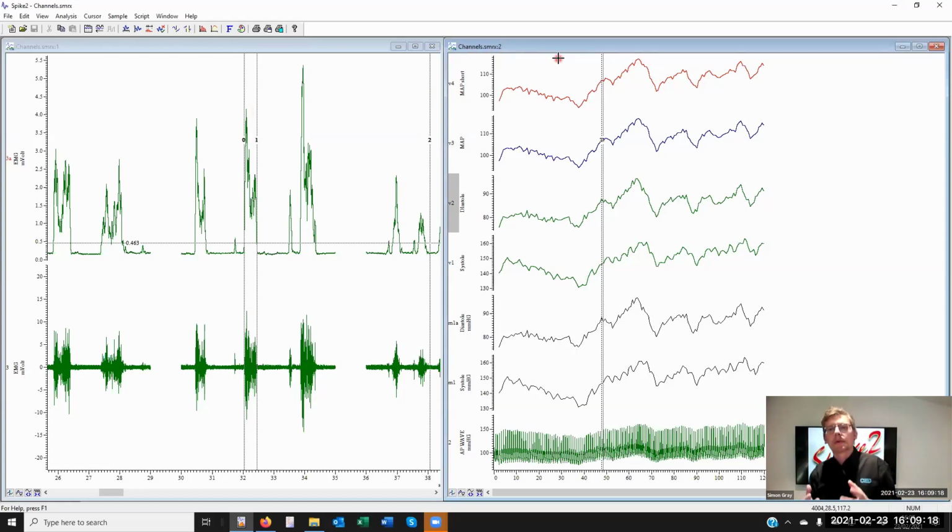Now remember, this could be set up as part of your sampling configuration. Cursor 0 can be stepping, and we can see the output in near real time.